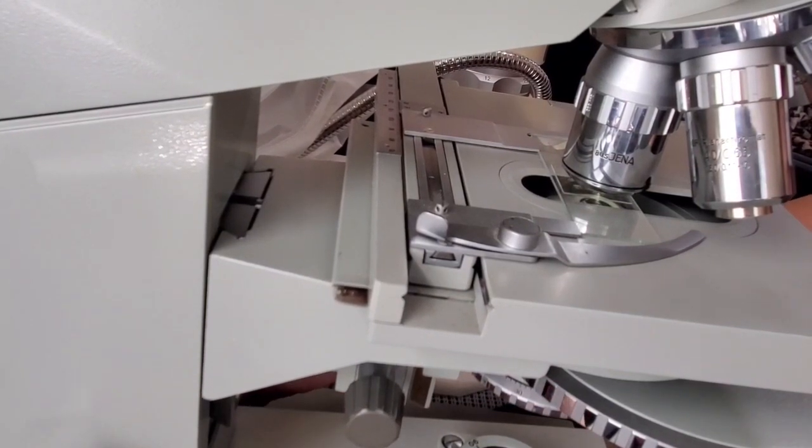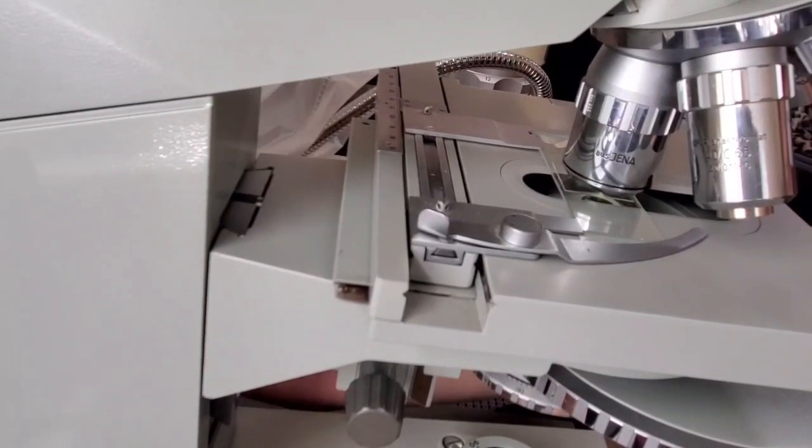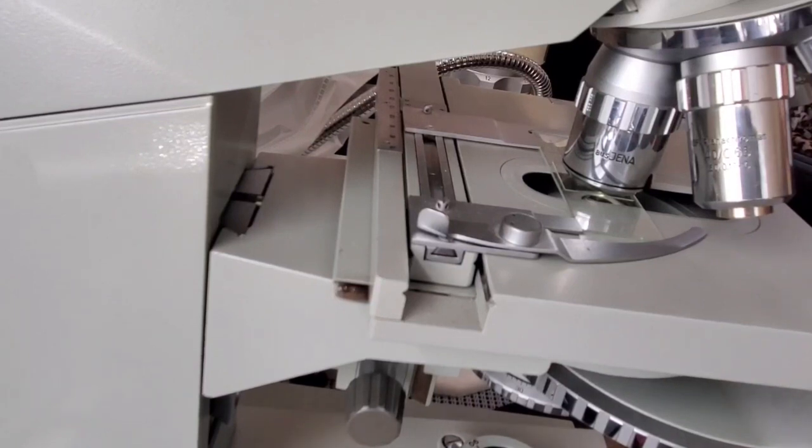Now there's a trick that I use: I actually just face the microscope and look at it, and I start to slowly go up until there's a little change in light, and that means that the oil is now touching all surfaces and we are ready to do the fine adjustments with the fine adjustment knob and look at our specimen.